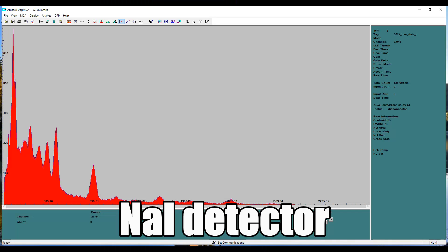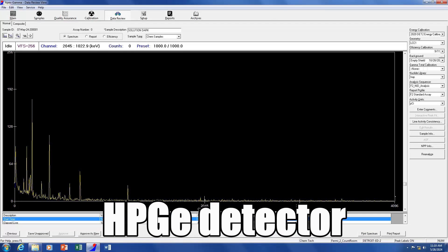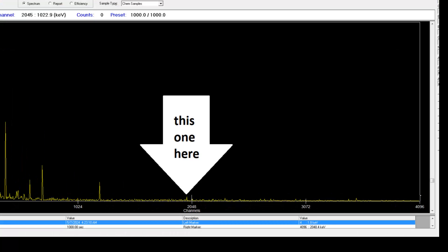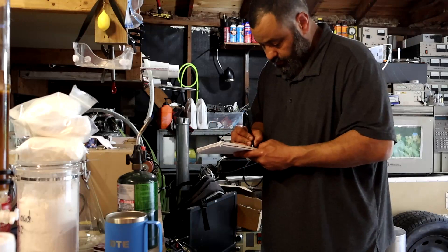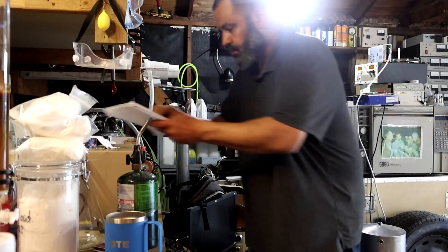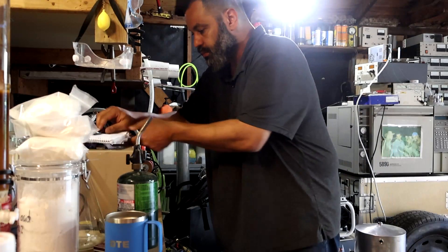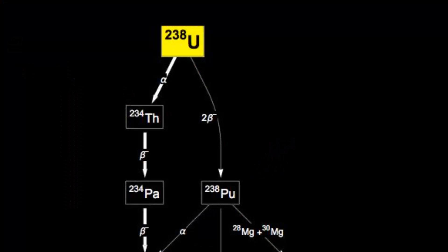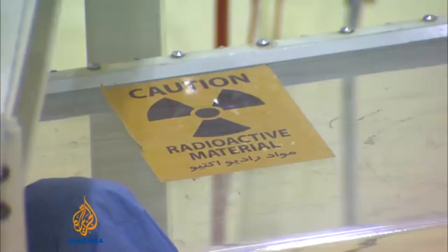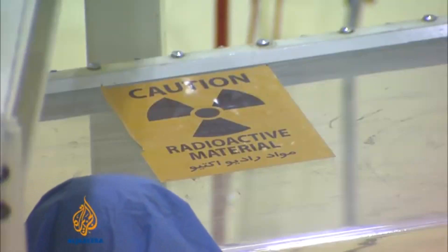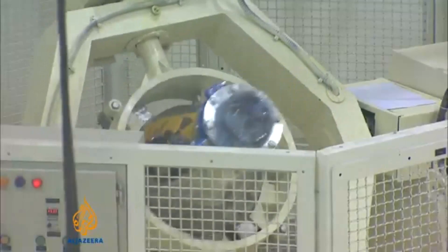In the higher energy region, there's a small peak at 1,001 keV. This is protactinium-234 metastable. This is an important one because protactinium-234 metastable is a decay product of thorium-234, which is itself a decay product of uranium-238. It is useful to determine the level of enrichment when collecting spectra from suspected nuclear smugglers' luggage.